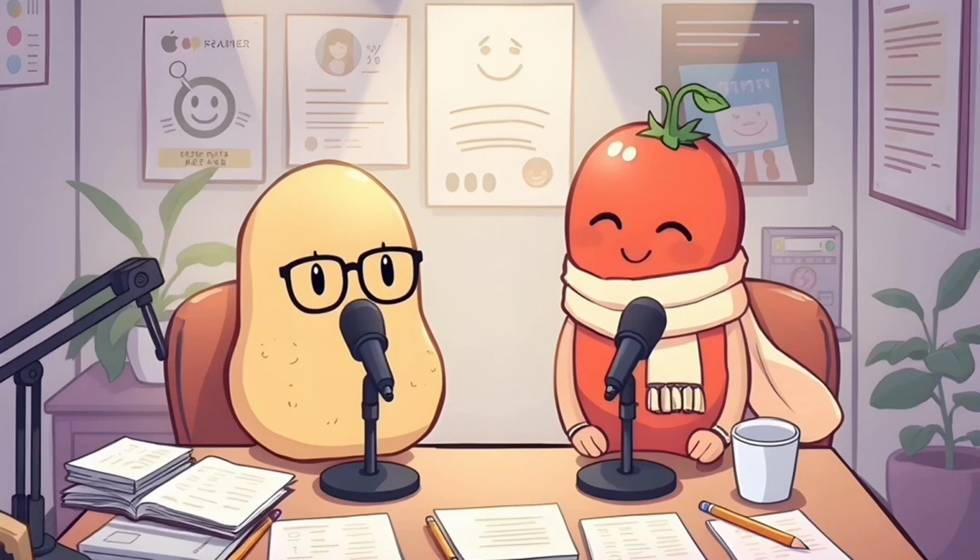Precisely. And finally, you have the actions, which are the precise movements carried out by our robot chefs. Aha, so like picking up a beaker, pouring liquids, setting the temperature. These are the actions that bring the tasks to life. You got it. All right, so platforms, modules, tasks, actions. Got it. These are the building blocks of any MAP, and then we have OCTOPUS layered on top to manage this whole system. Right. OCTOPUS is the conductor of the orchestra, making sure everything works together in harmony.